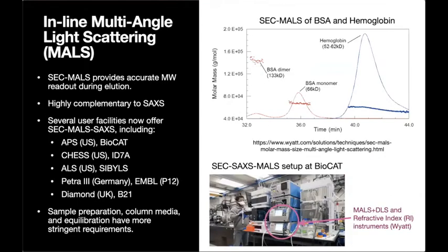Steve, just a short comment also, if you don't mind. We have experience that when we run a couple of protein standards prior to samples, the protein standards produce a clump on the capillary. It definitely increases the background a little bit, but for the samples afterwards we don't see so much capillary fouling, because the first layer kind of protects the capillary from additional aggregation of the samples on the capillary.